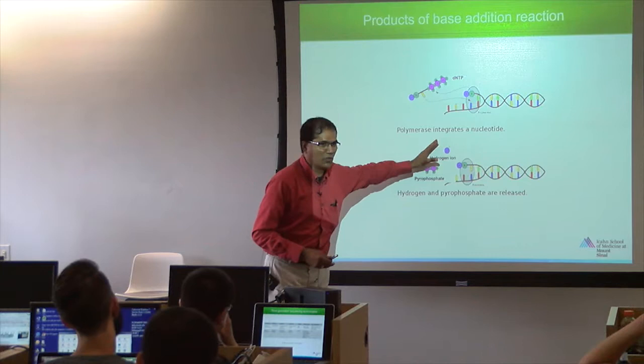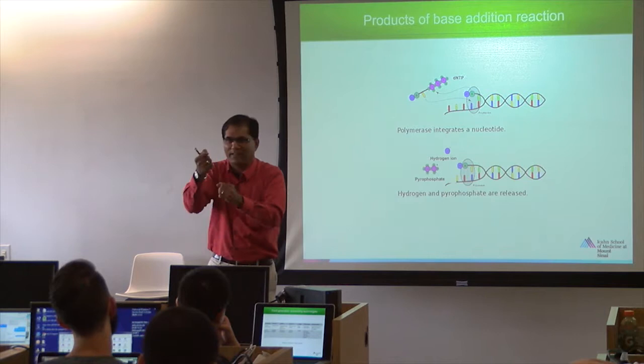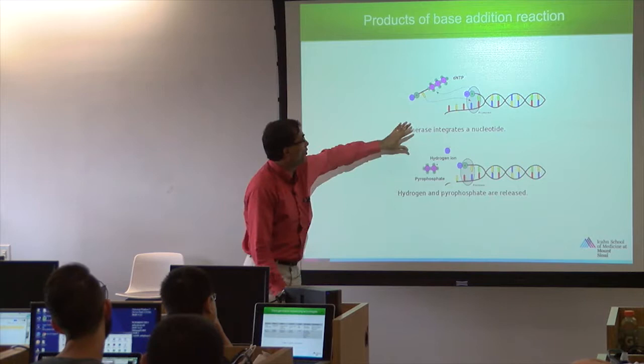But when it is added, you need the static fluorescence there. You see the fluorescence is static here for a millisecond. And then the video is videotaping, and you know what type of fluorescence wavelength it is. Multispectral camera is there. Okay? Isn't it cool? So we can videotape. It is possible now. We know how to do that. We know where to label it.